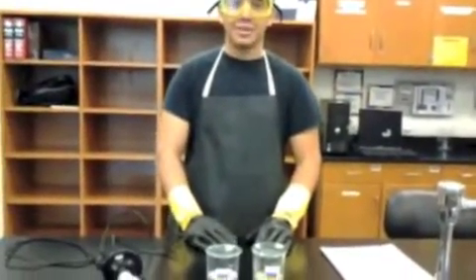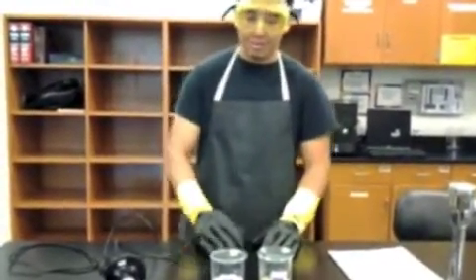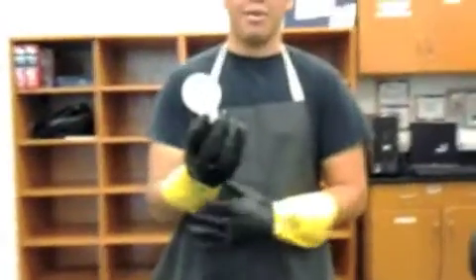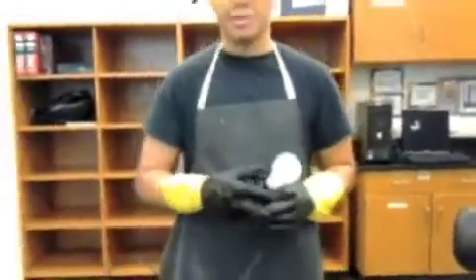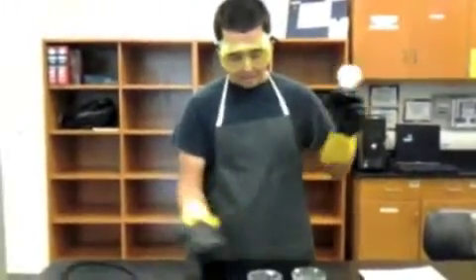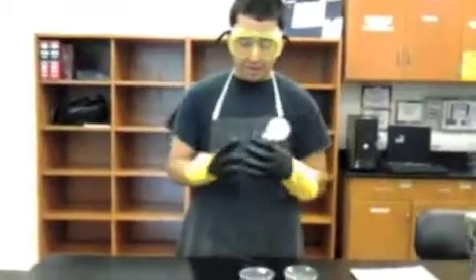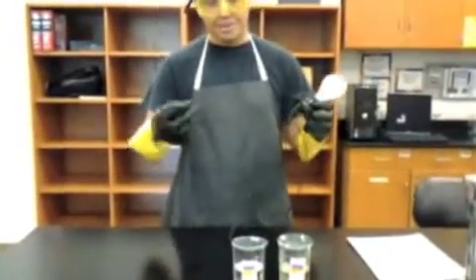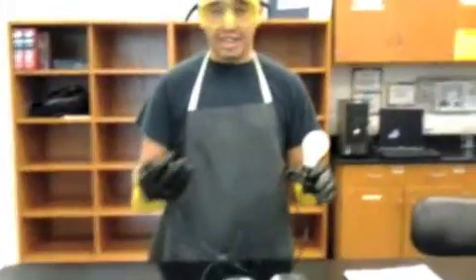Hi, my name is Alejandro, and I'm going to perform the experiment using distilled water, magnesium chloride, and a 75-watt light bulb. First of all, you have to remember to wear your goggles, your gloves, and your apron. Now, the first thing to know is, how does light travel through water? And if it does, how?